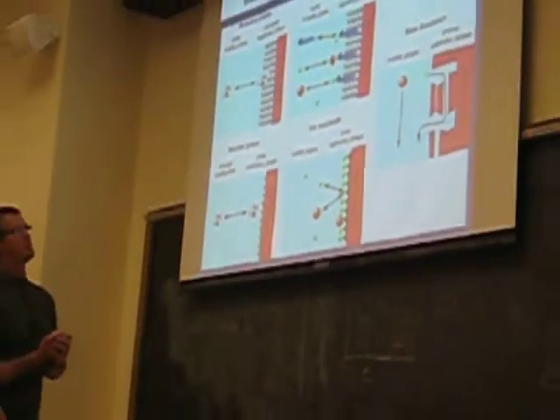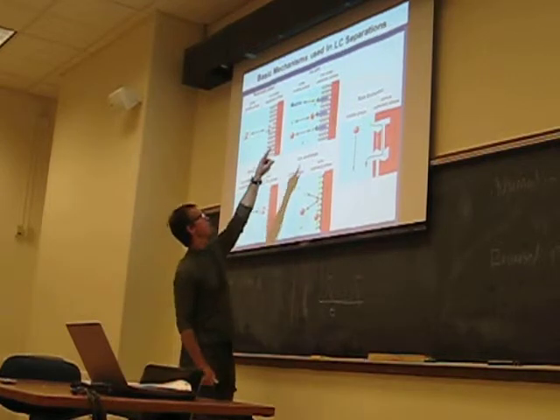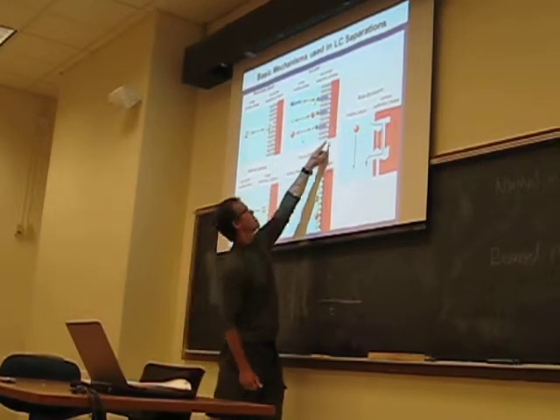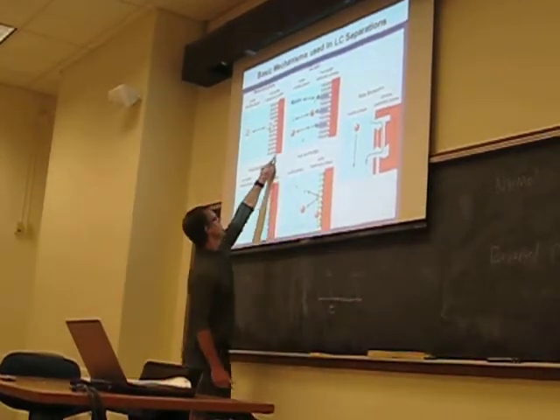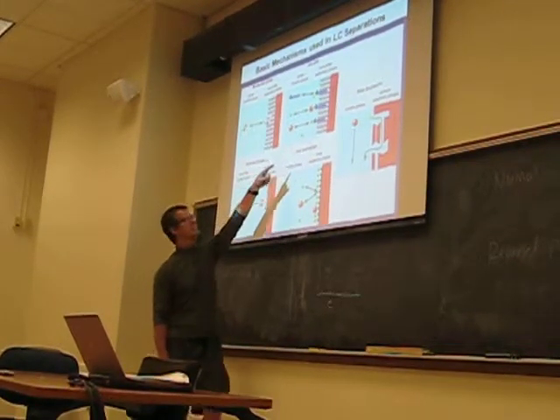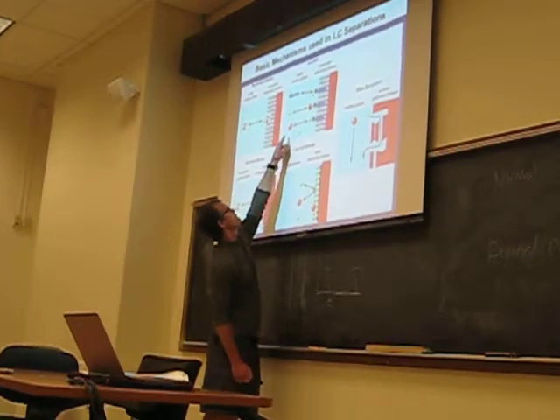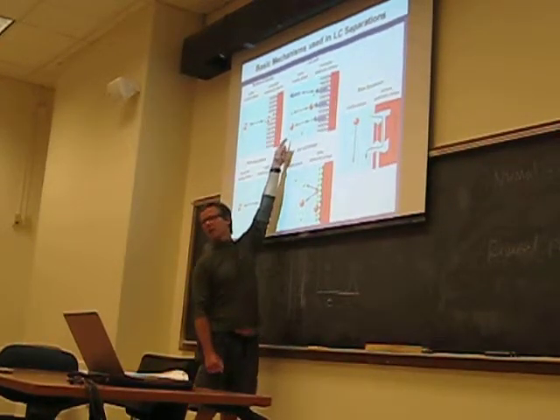So ion pairing is a very interesting sort of deviation of some of these methods. You'll note that in this ion pairing example, we have a stationary phase that's a reversed phase. So it's a C8 carbon stationary phase, but we're using it to separate things that have an ionic character.